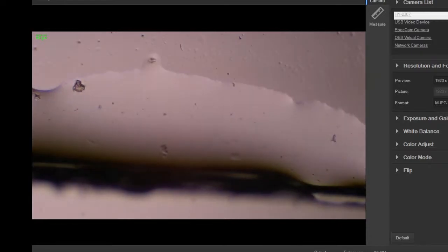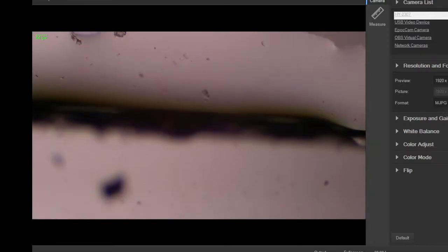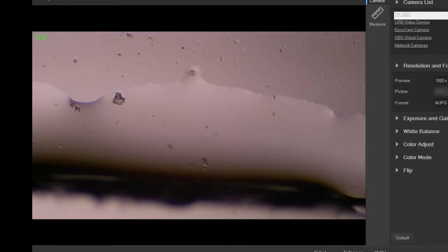And I've messed it up by putting the cover slip on it, so some of the concentrations get separated and then they start to separate out. Plus you can see the curvature there a little bit at the top. You can see there's actually kind of a curvature to the water, similar to what you'd see in a test tube with what's called a meniscus, where the water flattens out on the glass, and then because of surface tension, the water actually kind of bulges out a little bit.